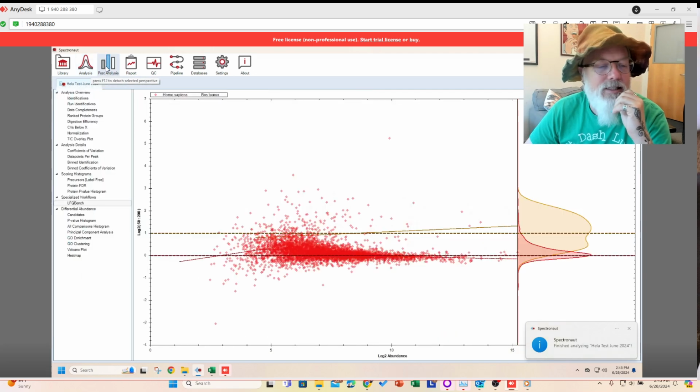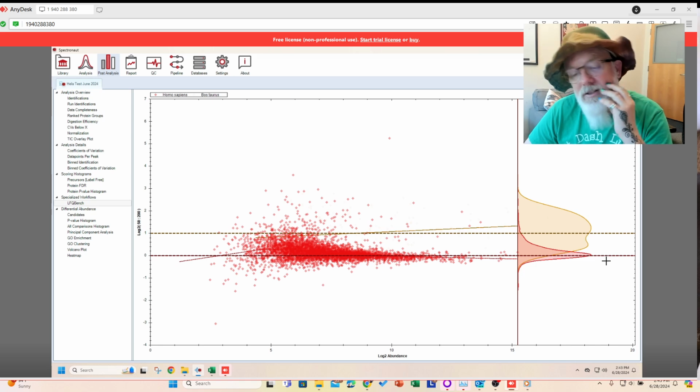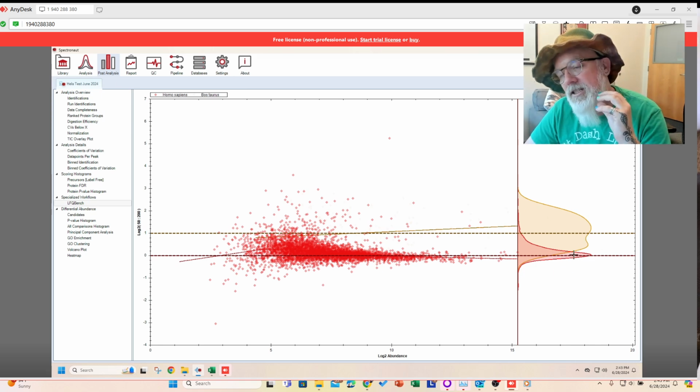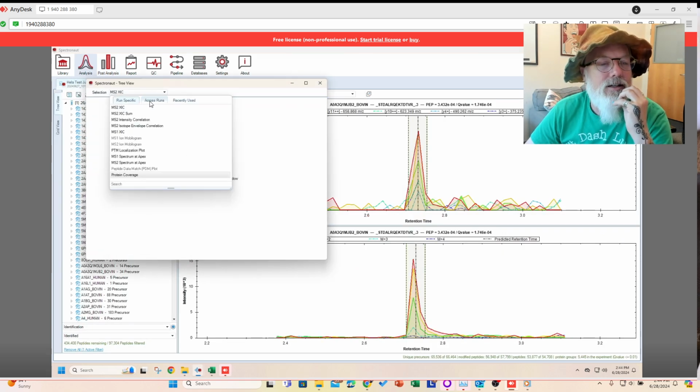And the best plot to see if that made any difference is this one. Yeah, maybe. I don't know. It looks a little bit more towards 0 than the other one. I could have taken a screen capture to check, but it's closer to the 0 line. Maybe that helped. And we can go back here and say across runs.